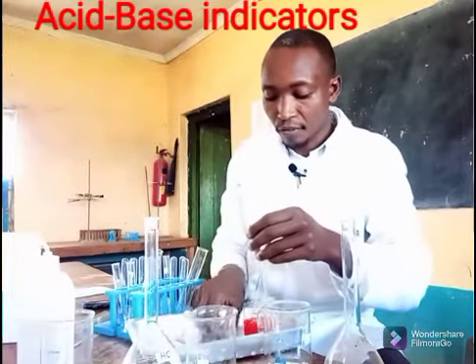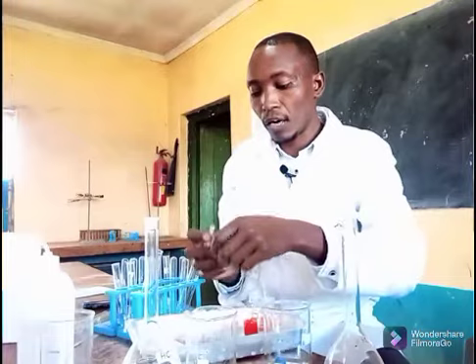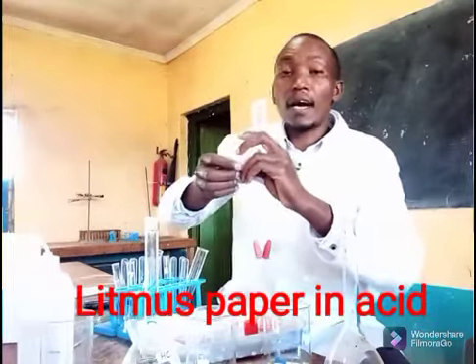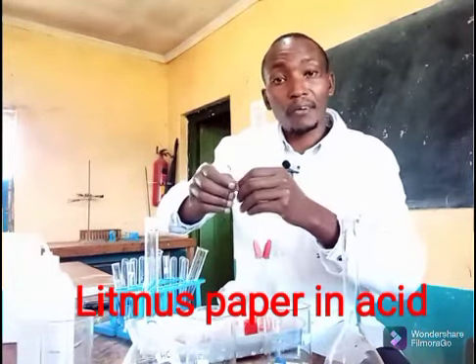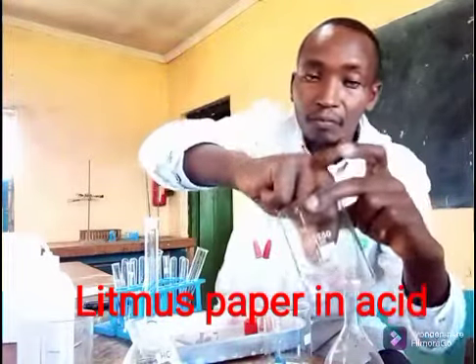Then I'm going to have another red and a blue litmus paper. I'm going to have the two. And this time, I will lower it in the beaker containing the acid.